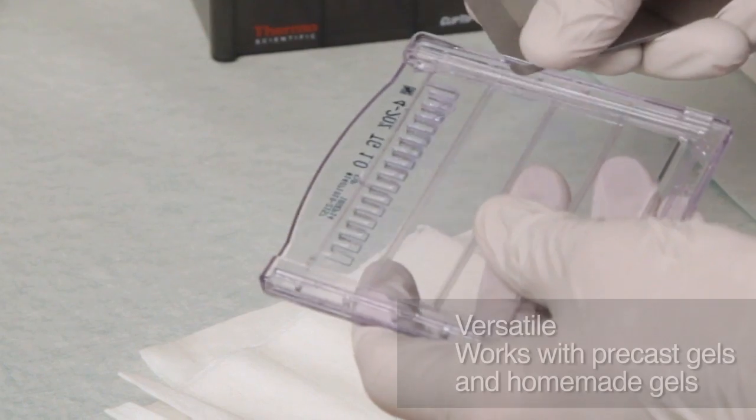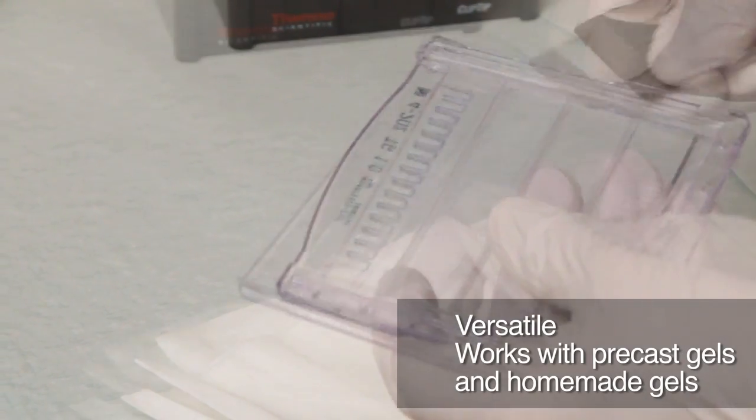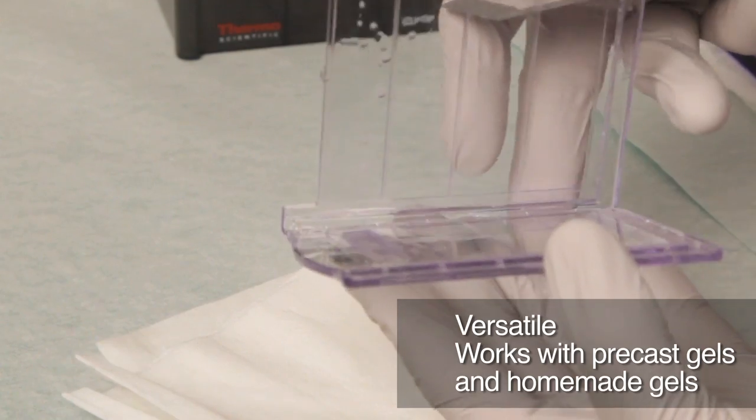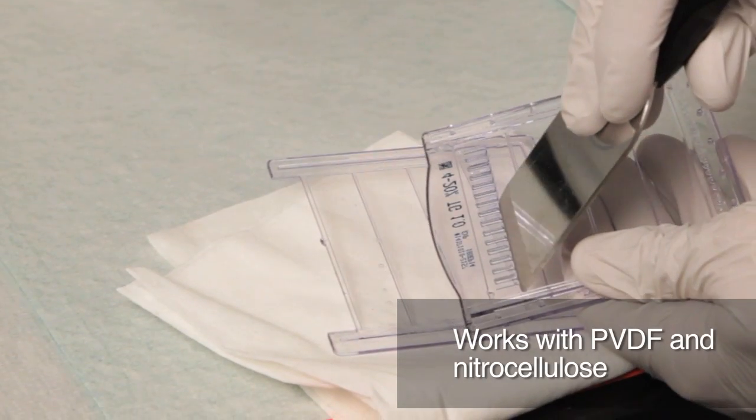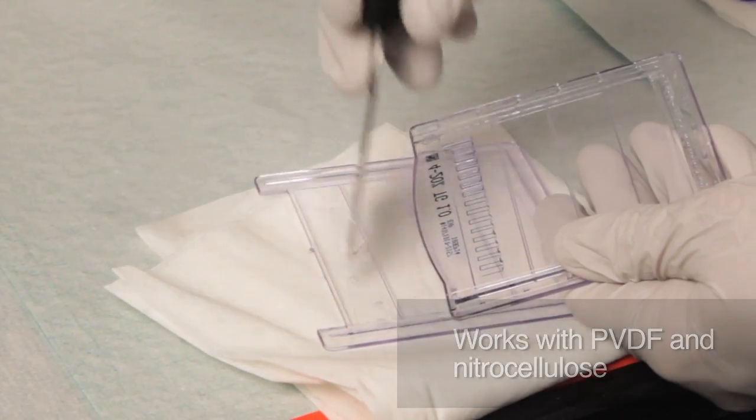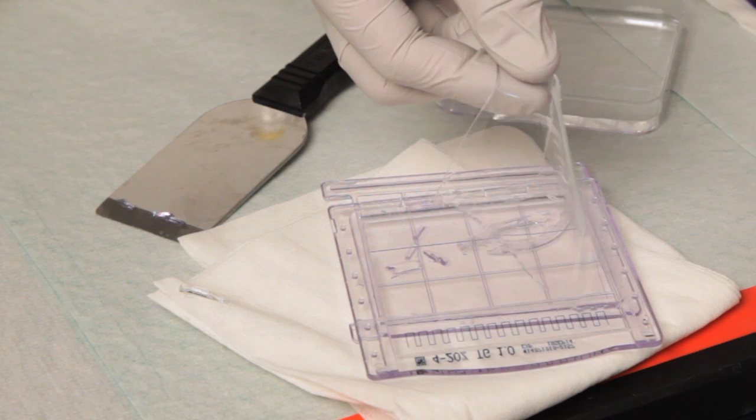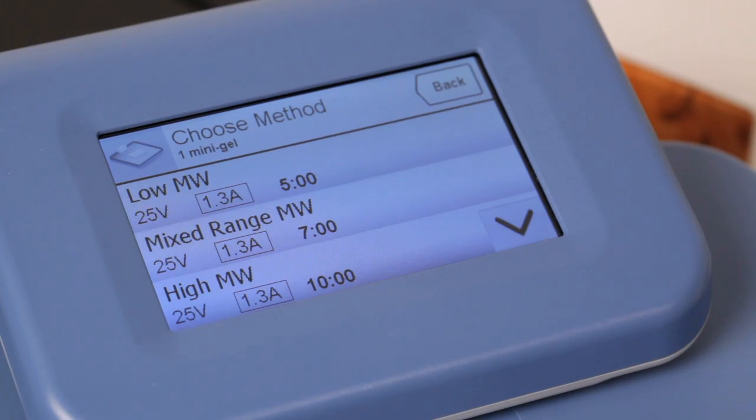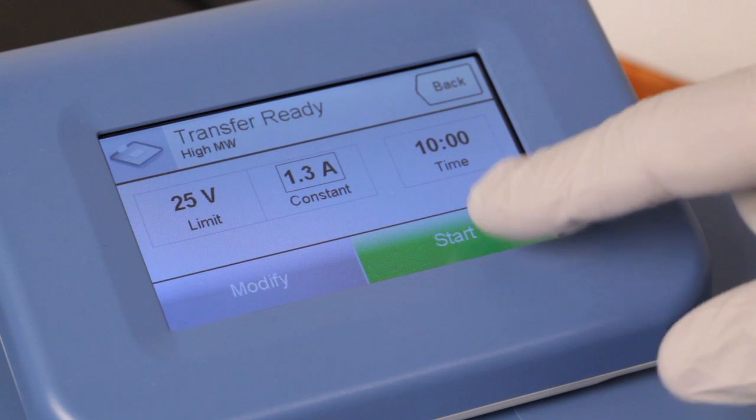This system has also been verified to work with several major pre-cast polyacrylamide gels, as well as some commonly used homemade gel formulations, and with both PVDF and nitrocellulose, demonstrating the versatility of the blotter for various transfer protocols.